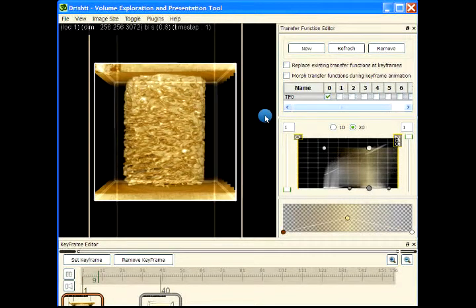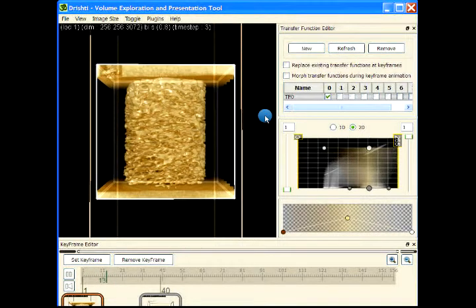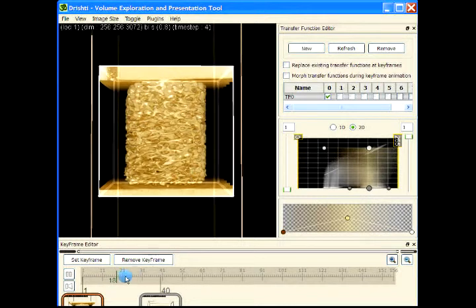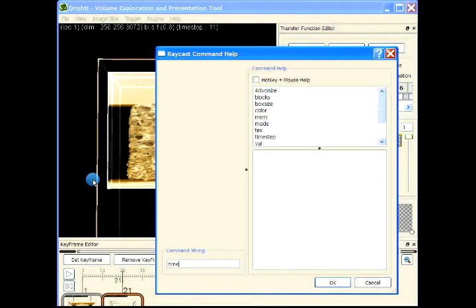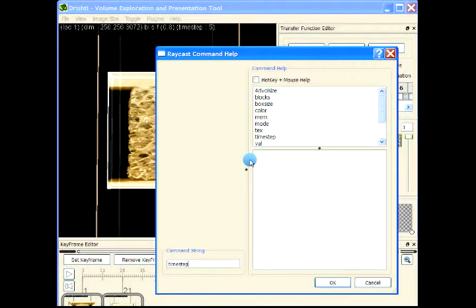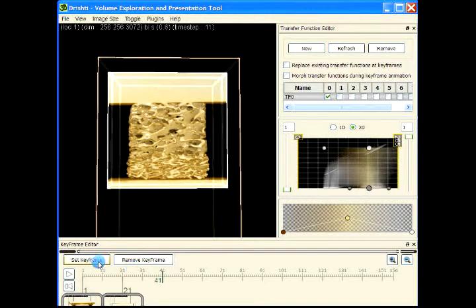That way you can easily create animations of a time series. So for example, you can take that here, and this one you can say that I want to go up to time step say 5, so the keyframe, and then here time step say 10, oh no, 11 here.